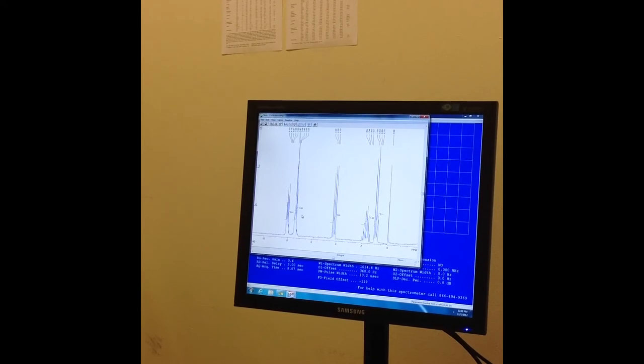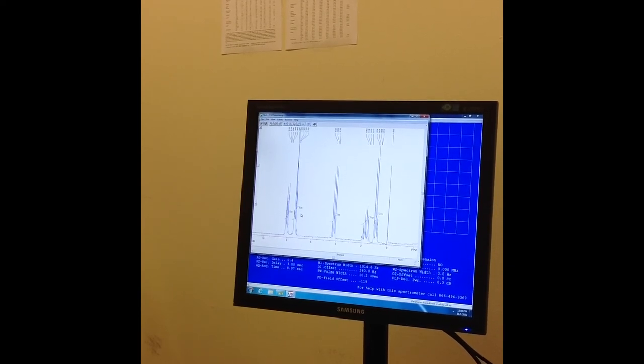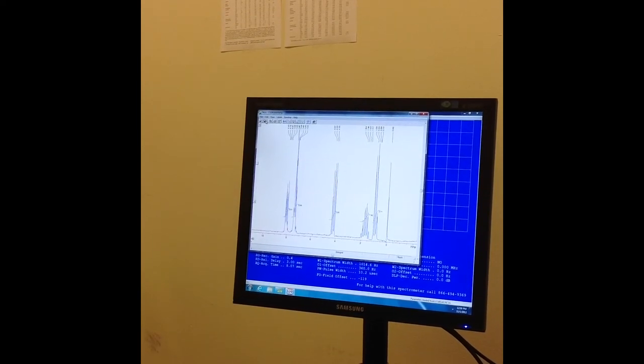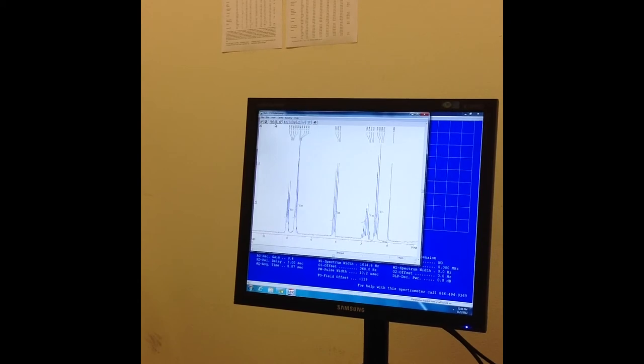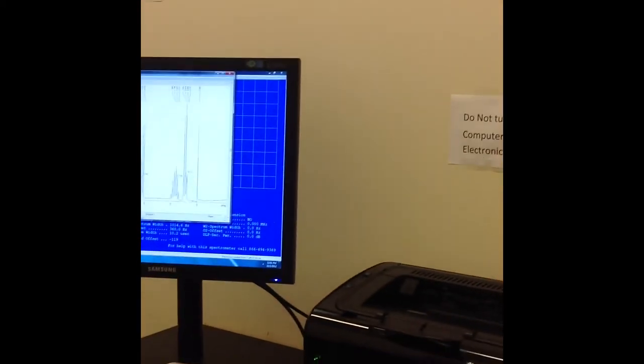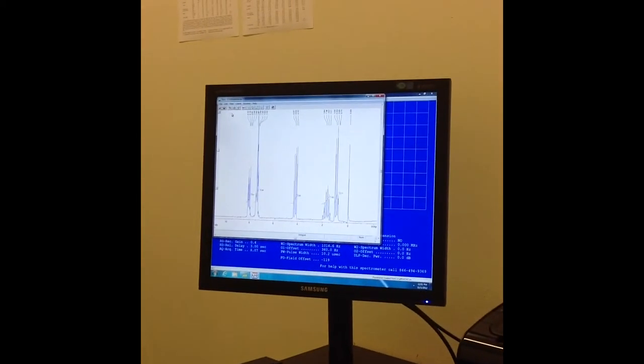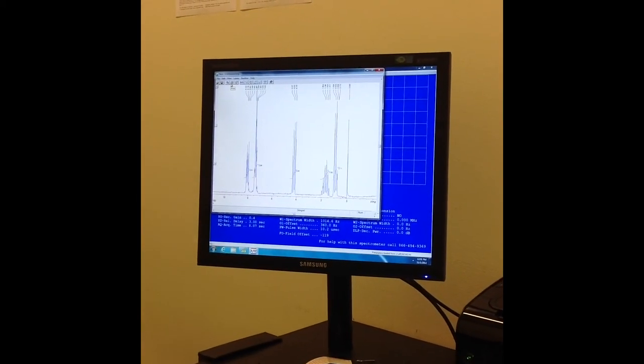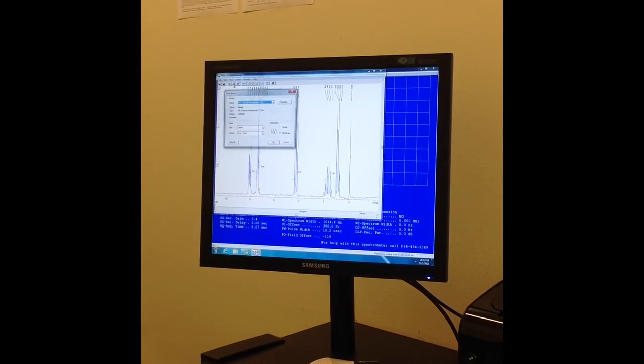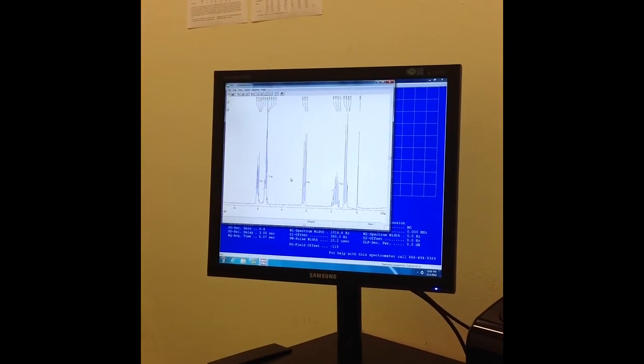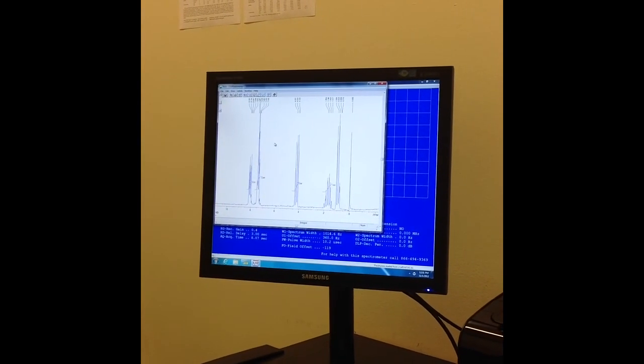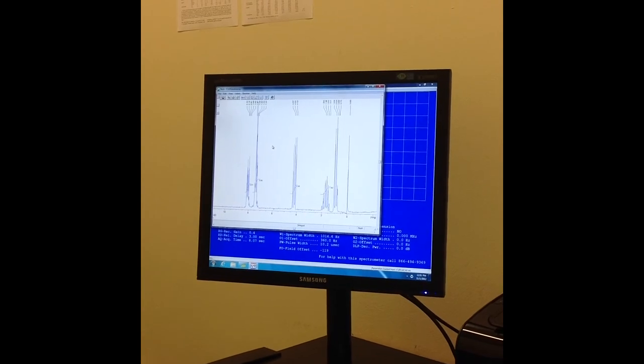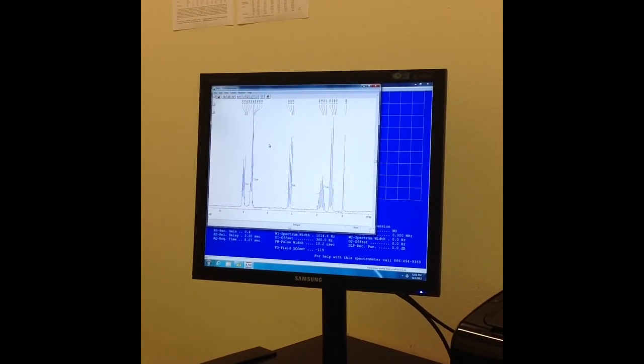Here are your values, so now it's not all messy again. Now I'm ready to print, and just make sure the printer is on, and I can click on the print icon up here. It should print out your spectra, like any time now.